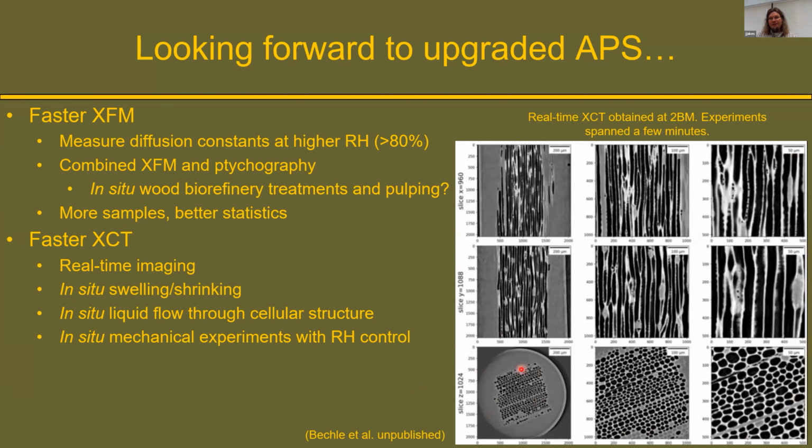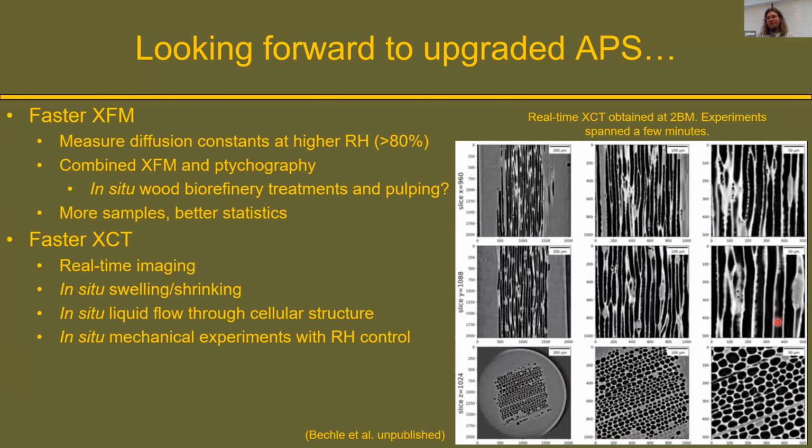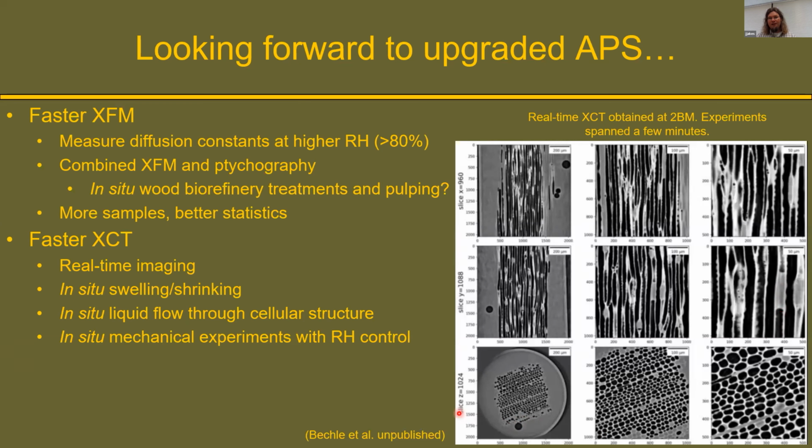And in this case, this is actually a piece of early wood that was put into a capillary tube that was filled with water. Each one of these images is a few seconds apart, so we're really able to observe things more in real time. Like here, you can see this water filling up this lumen, and you can see the air bubbles coming out of the wood.